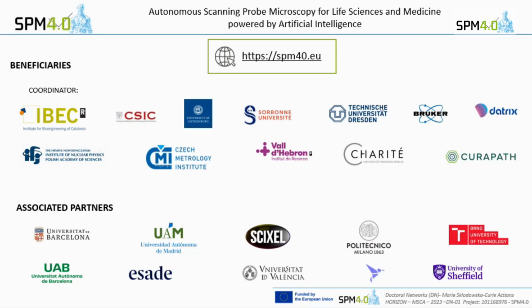I think a much more elegant method is to use specialized wells. What you need to do is that usually these cells like to stick to surfaces, and you need to make the surface less sticky than the cells. And the cells want to stick together. And we use wells that have a U-shaped bottom, which have a non-adhesive treatment. Basically, all the cells collect at the bottom and form the spheroids.